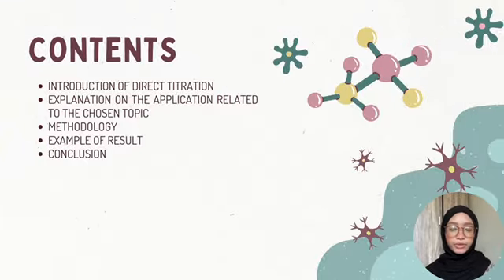In this video, we are going to talk about the introduction of direct titration, explanation of the application related to the chosen topic, methodology, example of the result, and conclusion.